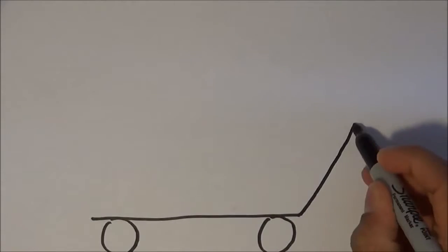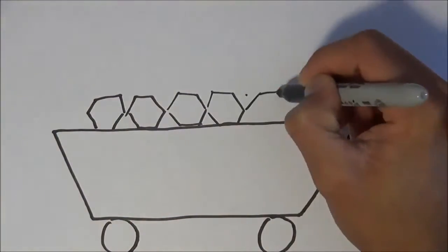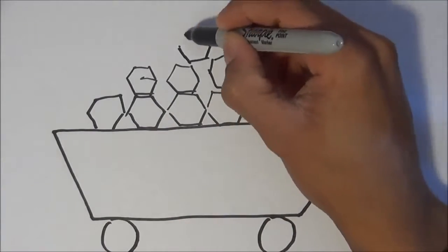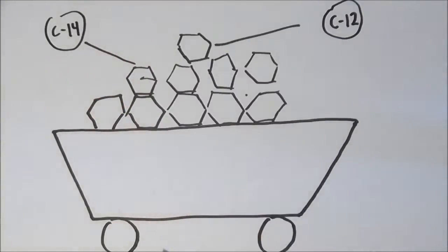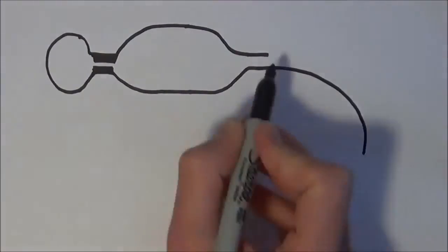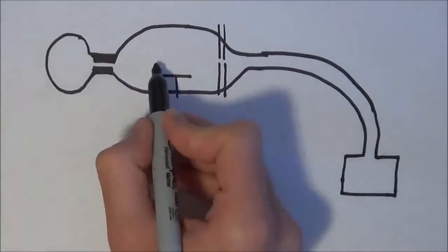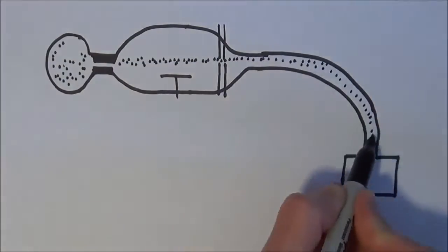You could take a chunk of carbon and weigh it to find the mass of one carbon atom. But then we come across a problem. There are many different carbon isotopes, each with different masses. If only there was a way to separate each particle. Luckily, we have a technology called mass spectrometry that can accurately measure the chemical makeup, the mass-to-charge ratio, and even the mass of a sample and its components.